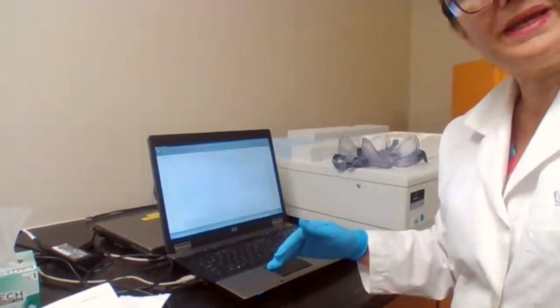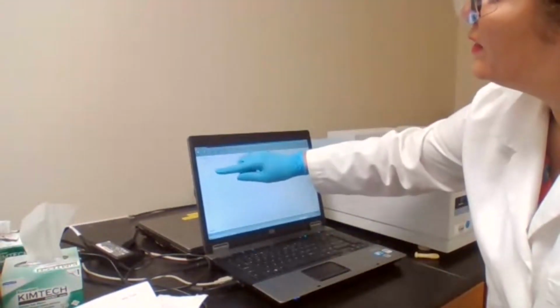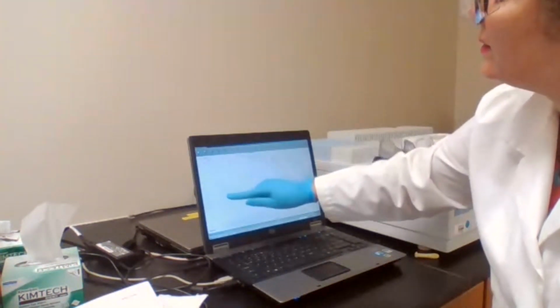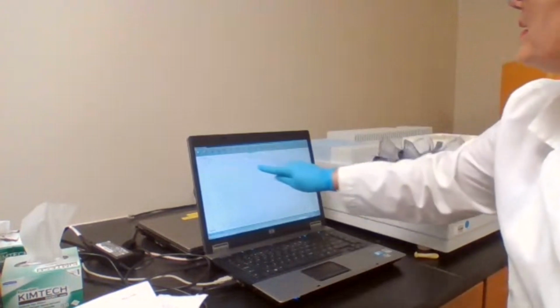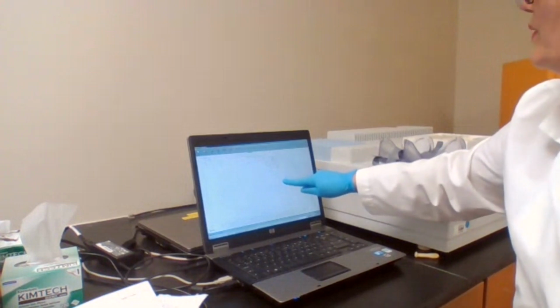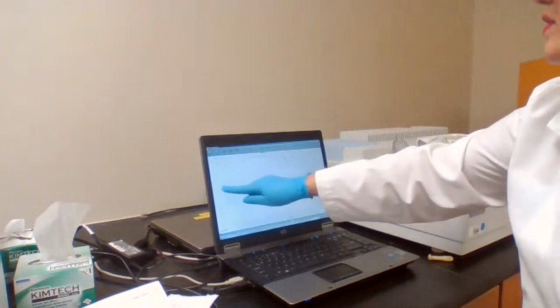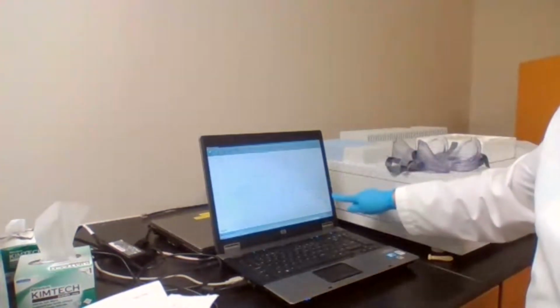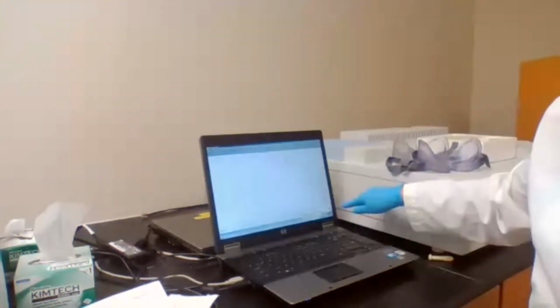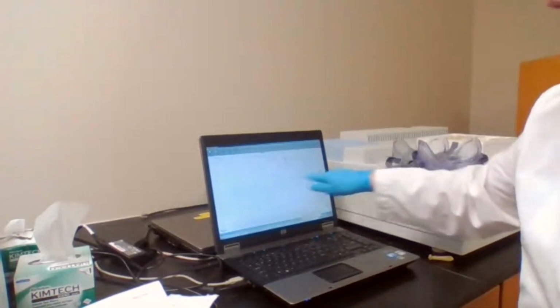When I talk about major peaks, those are the peaks that pass the line of major ones. Comparing the 1411 here, 1451 would count as a major peak. So we have 1, 2, 3, 4 major peaks here for this compound, and this one is a major peak because it's reaching the baseline. So major peaks are only about 4 if you want to identify.